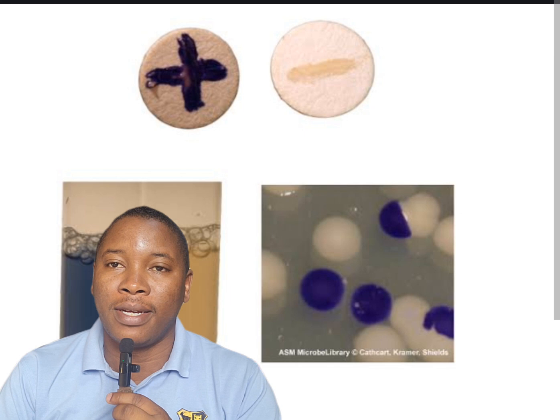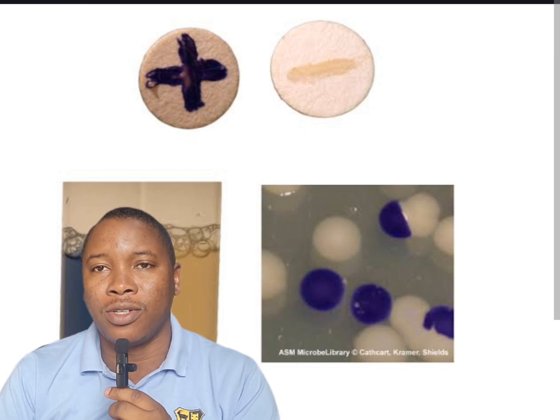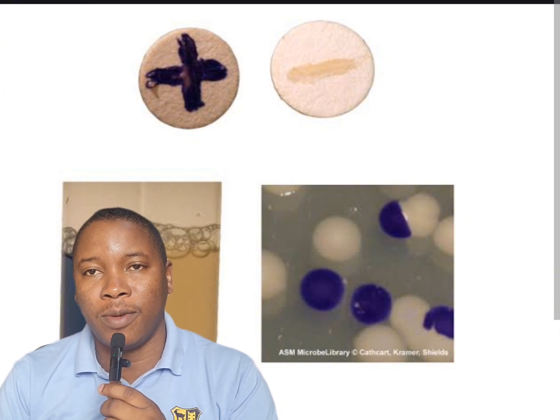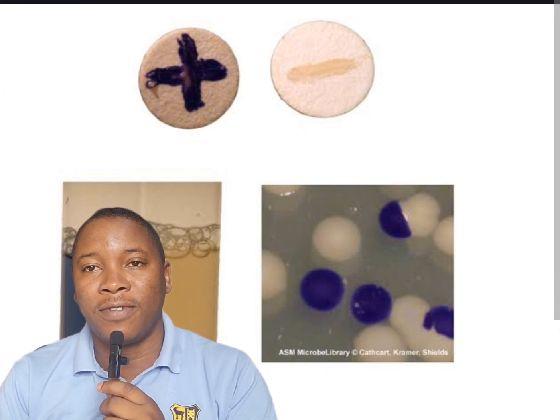Today we're going to discuss the oxidase test, which is one of the tests that we use in our biochemical battery of tests. Remember, we're discussing biochemical identification of microorganisms.